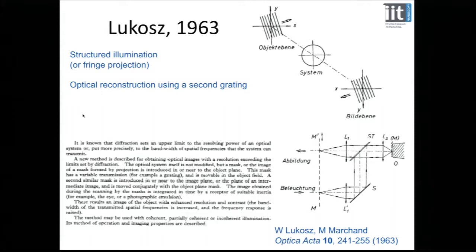And in Lukosch's paper, this is a bright field system. It's not a fluorescent system. Although, you see, I've put here that the method may be used with coherent, partially coherent, or incoherent illumination. So I think he was of the opinion you could do this with fluorescence as well.